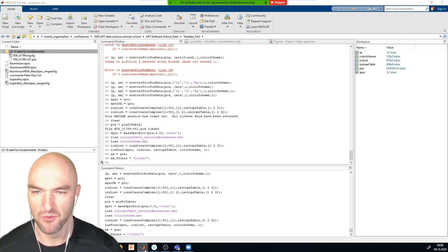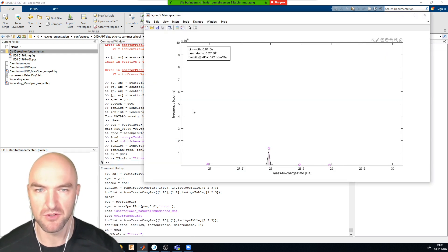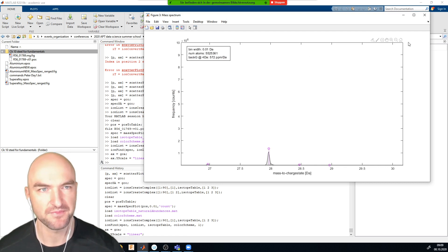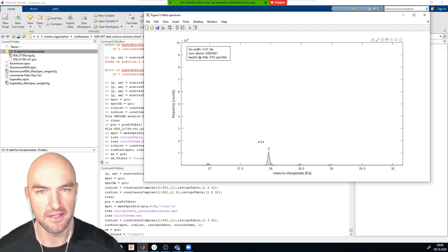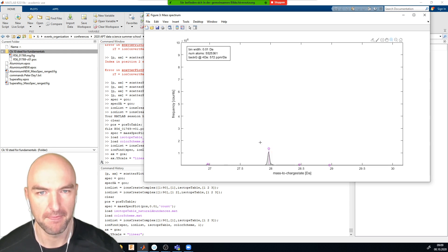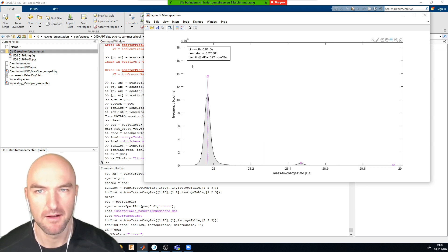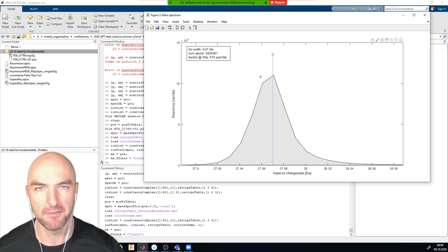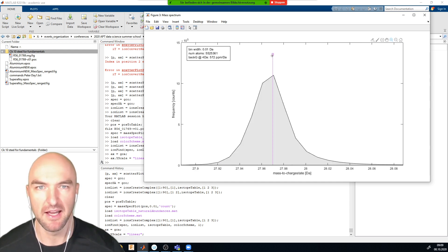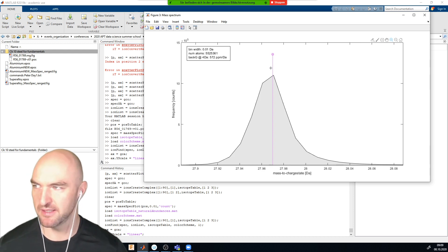If I move the mass spectrum to a linear scale, what you can see is that there is quite a fair bit of iron missing.